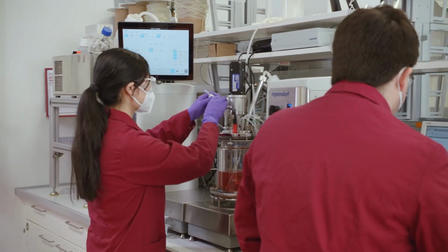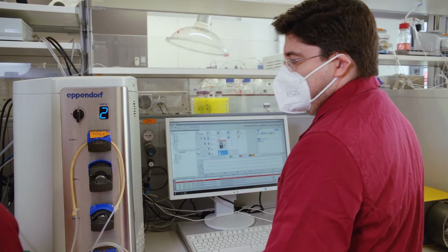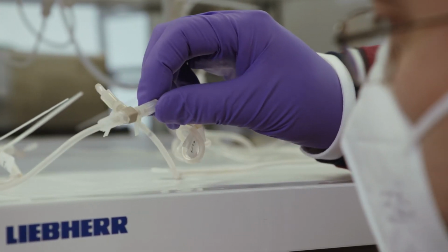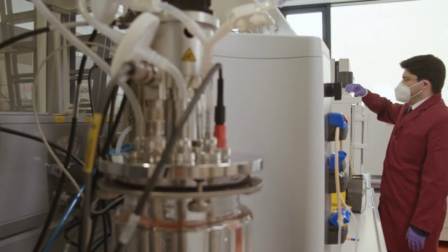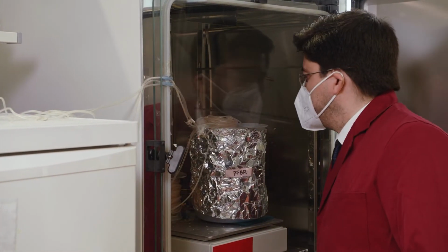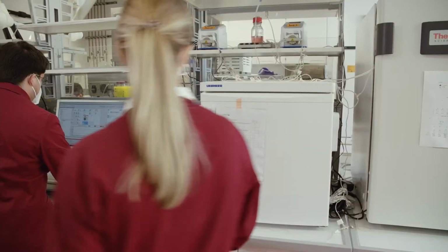First, we have a continuous stir tank reactor where we grow the cells, and at the same time, we collect our cells. Then they go to a point that we call the point of infection, where we have very little amount of virus particles, and the cells, they get infected. And then they enter the tube. What happens inside the tube is that the virus propagates. So the virus infects a cell, and then from one virus particle, you produce 10,000 virus particles, for example.